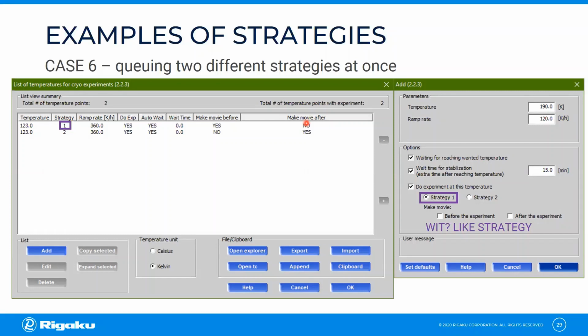But you cannot get back here in time to change the sample or switch to the other strategy. At that point, you can just select the first strategy as what-it-is strategy, and the second one as a complete high quality DC strategy.